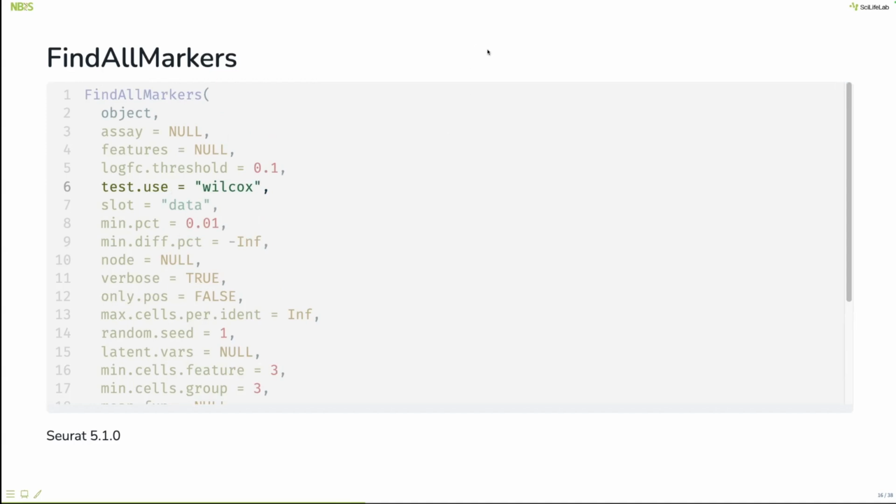Yes, question? Hi, Jennifer. Yes, thank you. So you said that this will be performed in the RNA assay, either in the normalized or in the scale data, but not in the integrated data. So integration is only for visualization then? It's for clustering. For me, the integration is mostly for the clustering, and then it doesn't really matter how we see it. We perform differential expression in the non-integrated data. So basically, yes, we don't need to do integration at all for differential gene expression.